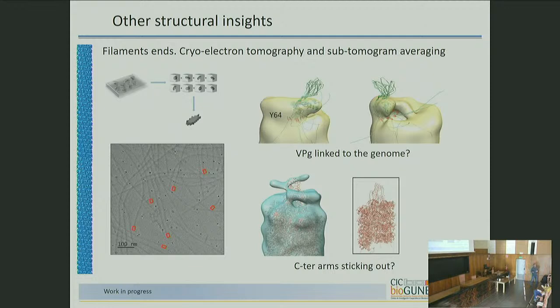But the only thing that fits with what we know, because we know the polarity, is that this could be the VPg that is linked to the genome, because the shape fits. This is some flexible region. This is an ensemble from NMR. The red residue that is here is the one that is attached directly to the RNA. So in distance and orientation, it fits. So we think that this is the protein, but we don't know for sure.